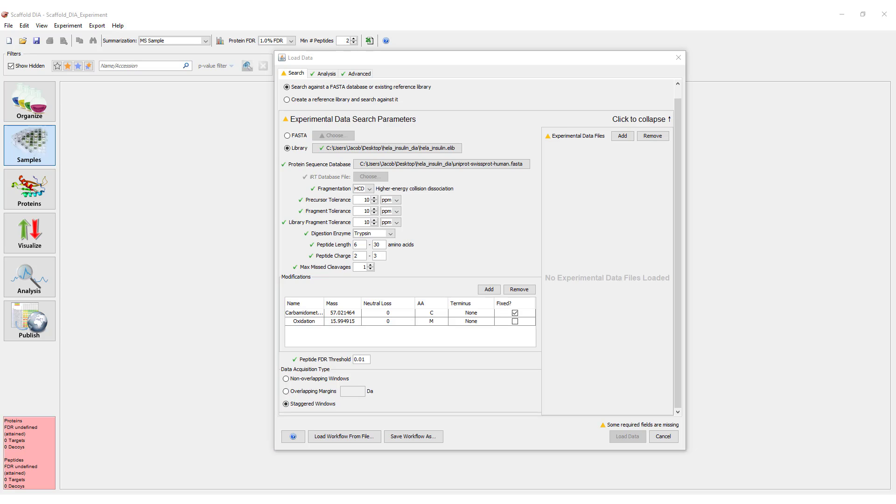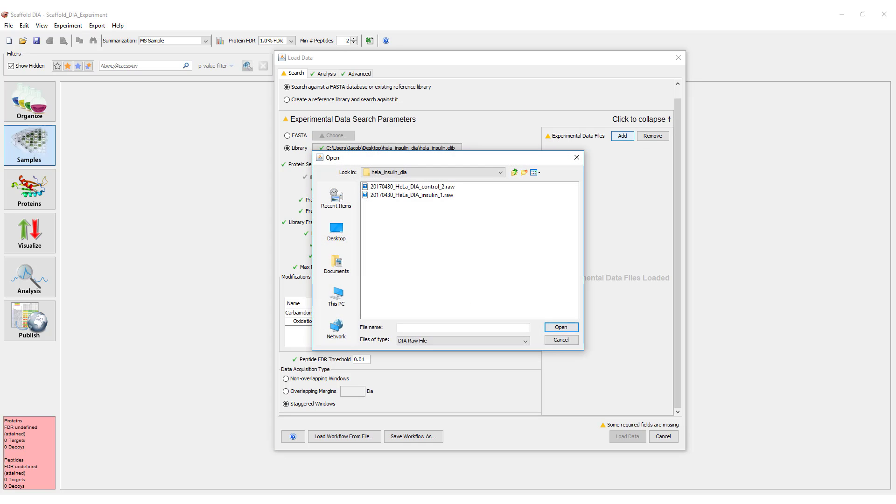Finally, we can select our raw experimental DIA files using the Add button on the right-hand side. Once this is done, the yellow triangle should be cleared from the Search tab.